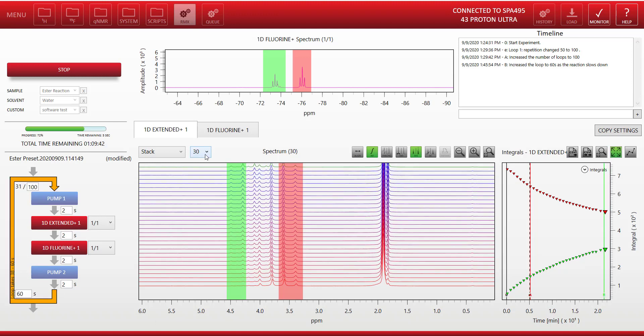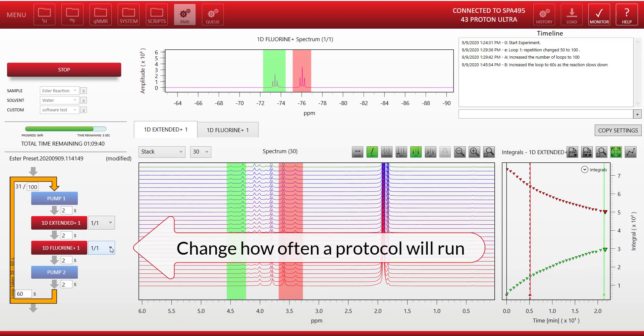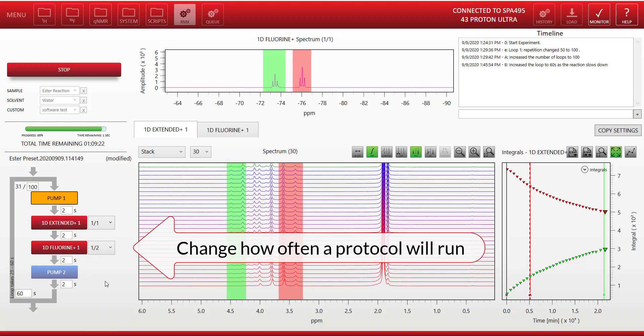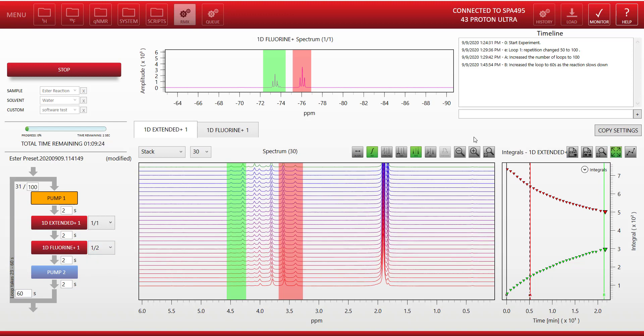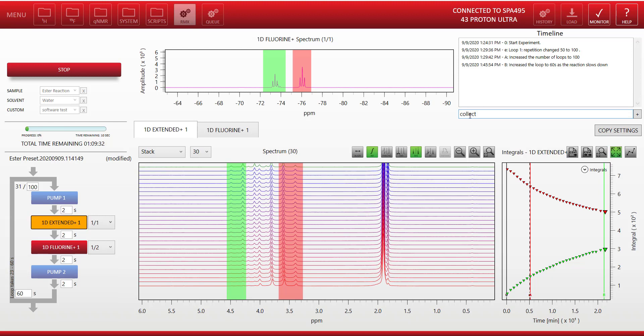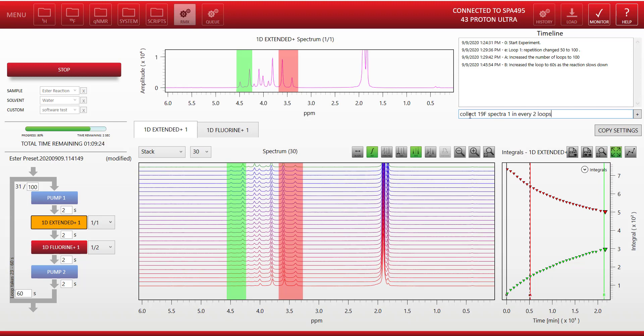Another useful feature we mentioned before was the ability to acquire spectra only one in every two loops or one in every three loops. So here I've adjusted the fluorine protocol, so I'm reducing the number of times we're running the fluorine experiment. And as my reaction is slowing down, I may have some good reasons to do that.